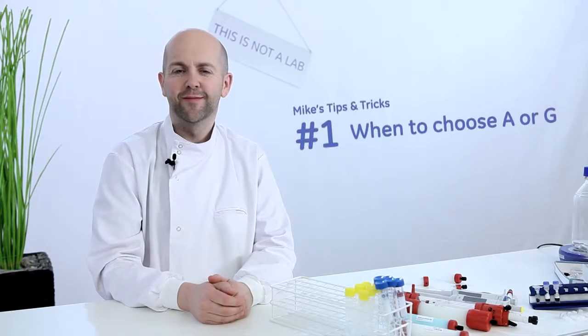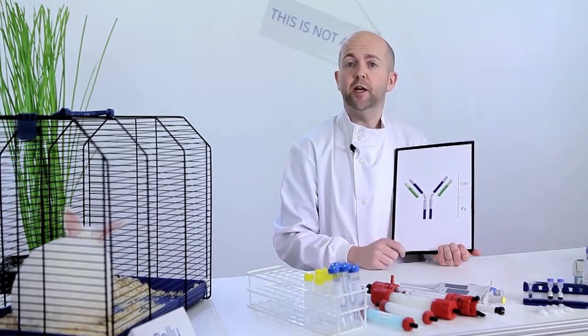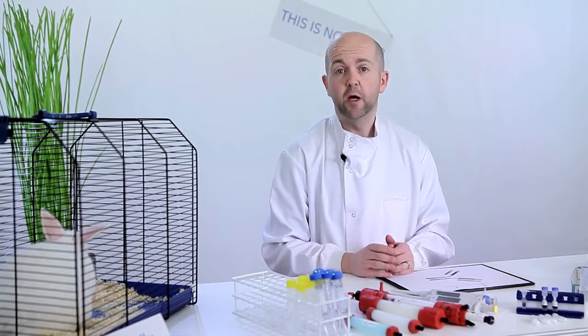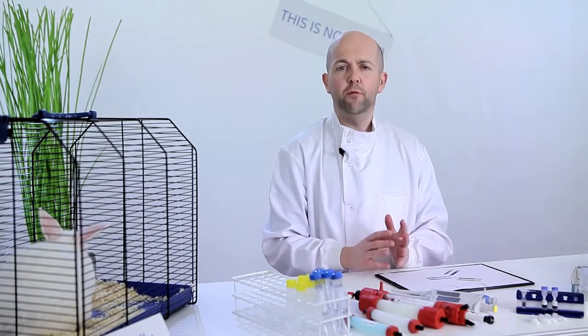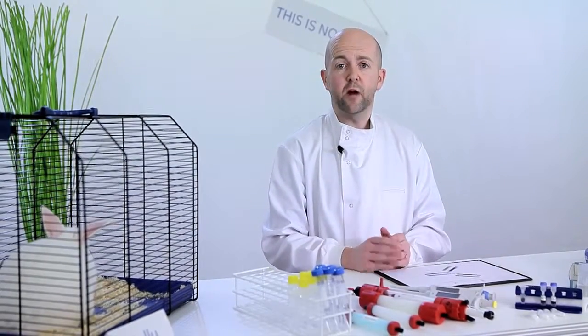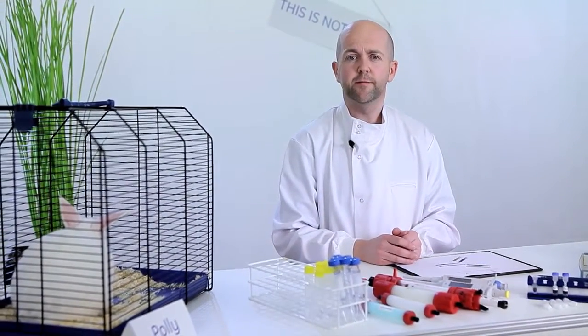Okay, Mike's first tip. It is straightforward to decide when to use protein G or protein A. As long as your antibody has the FC region, protein A and G can be used for purification. If there is no FC region, then an epitope tag is needed, but I'm not going to deal with that in this video. Protein G is the first choice for general purpose capture of antibodies because it binds a broader range of IgG from eukaryotic species and more subclasses of IgG than protein A, usually with a greater efficiency.